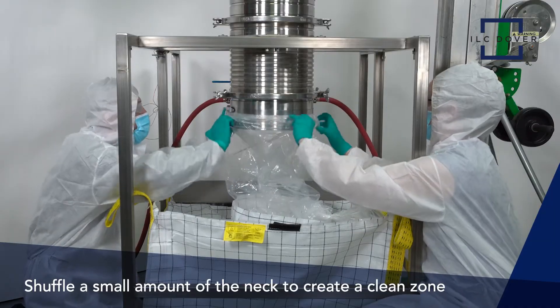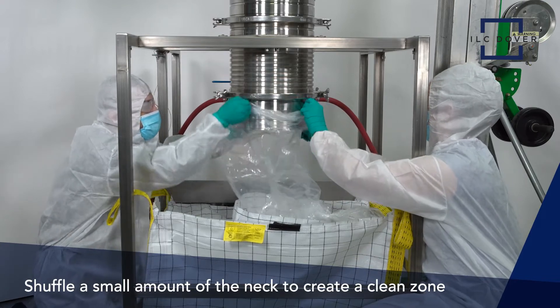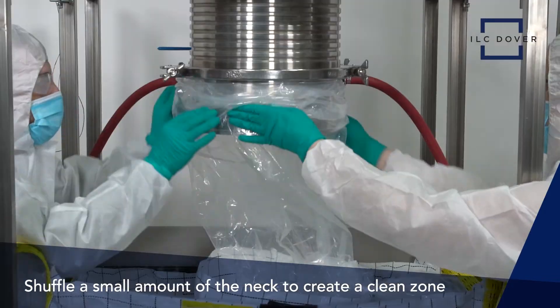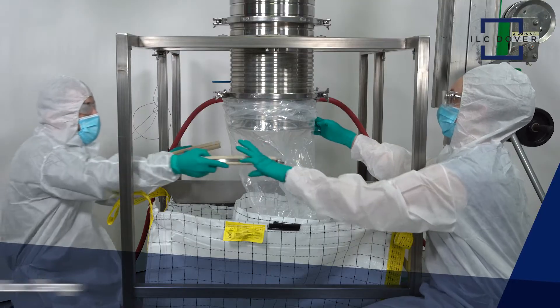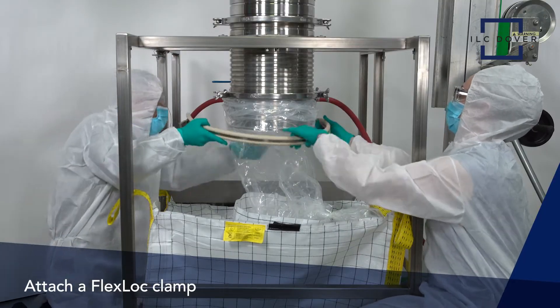Next, we want to shuffle a small amount of the neck onto the canister to create a clean zone, which will be used to safely crimp and detach the bag from the canister in a later step. A FlexLoc clamp is needed to cleanly charge the vessel.